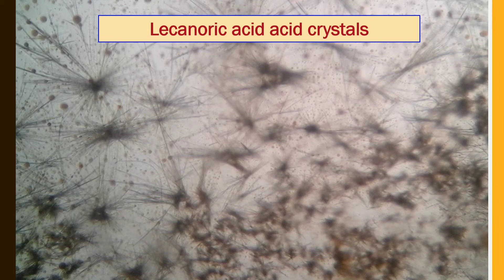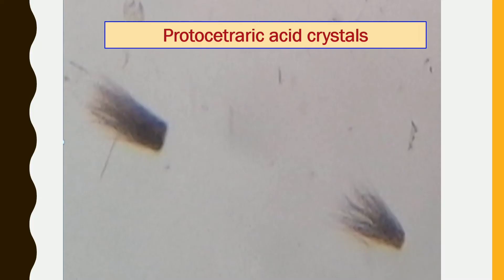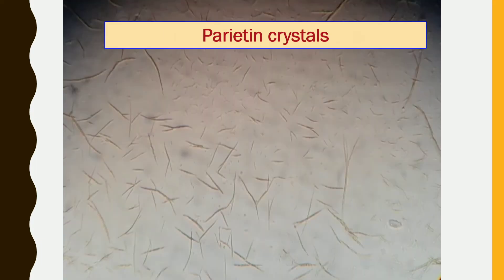Lacunoric acid crystals are star-shaped crystals identified from Parmelia mastocyanins. Calicin crystals — look at these — have been identified from the Chrysotrix species. Protocetraric acid crystals were identified from Flavoparmelia caparata species, and usnic acid crystals were identified from the Ramalina species.